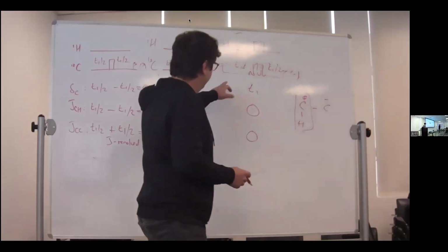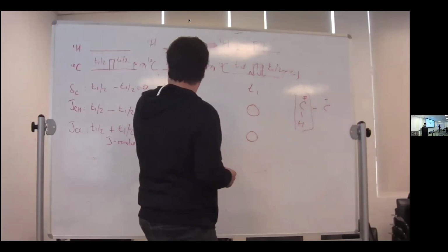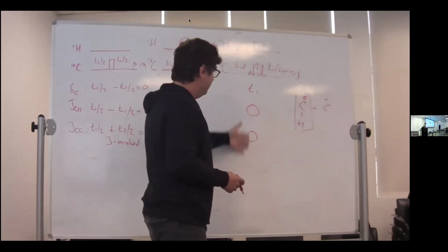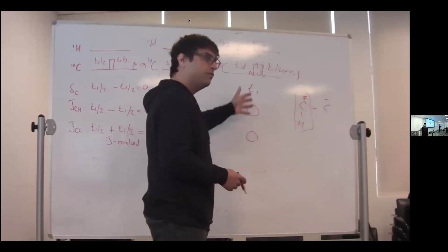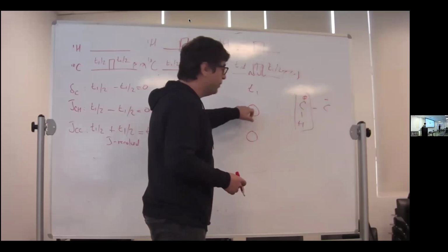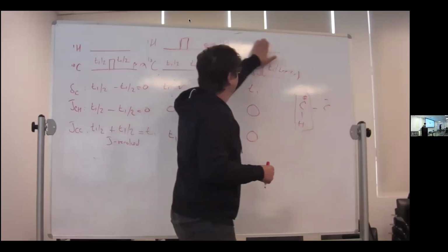Okay, so here we've accomplished a little bit. This is kind of an interesting experiment because you just have chemical shift evolution. It's a wonderfully decoupled HSQC, right? But we want the CH back. So what was your suggestion? Remove the proton pi. So let's remove the proton 180.